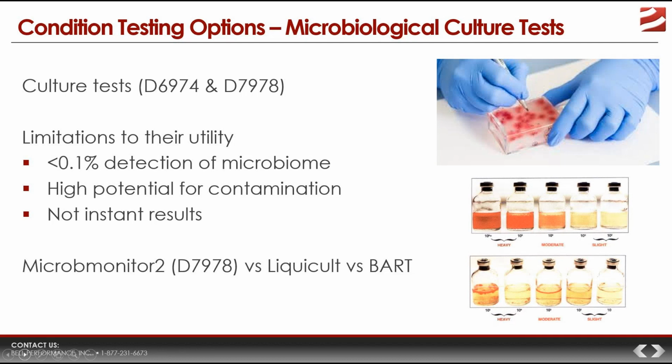And then third one, culture tests, you have to give them time to get results, typically between 3 and 5 days. Now, that is a severe limitation to their usefulness out in the field. If you wait 3 days for tests to incubate, how do you know if what you're seeing really represents the microbiome if you got outside microbes in there and you gave them 3 to 5 days to grow and multiply?